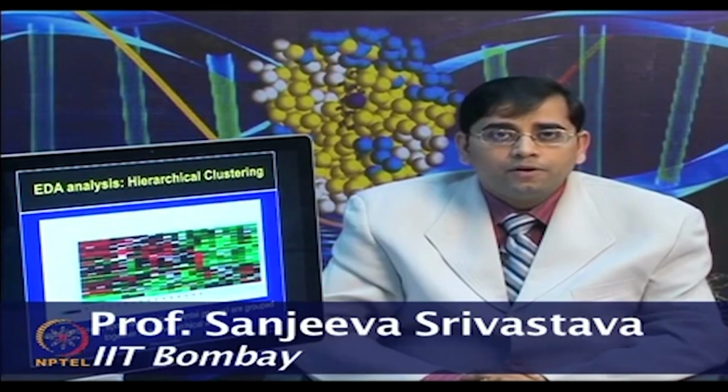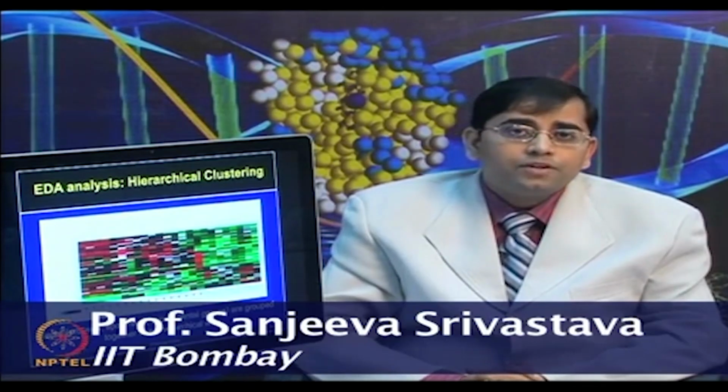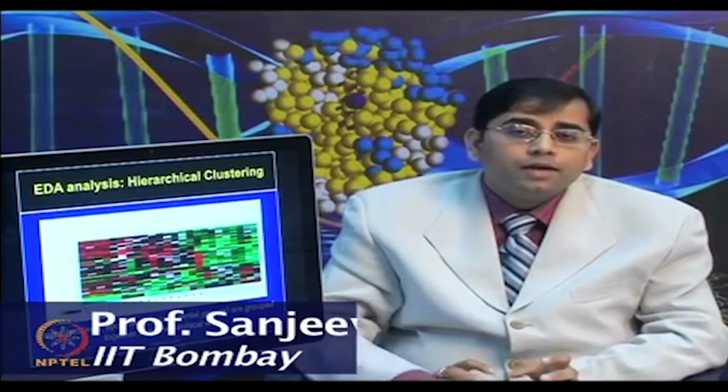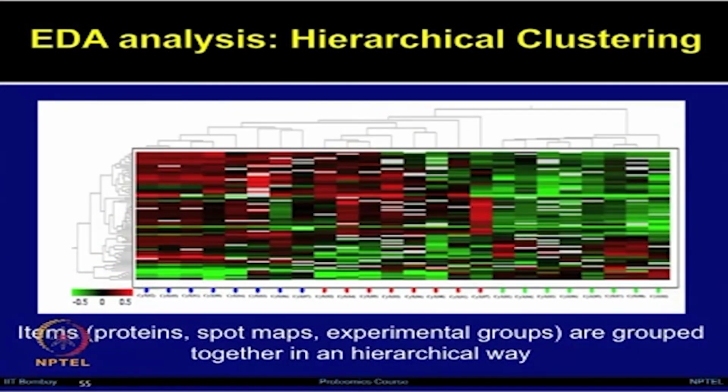giving very useful information. For example, in this data we try to look at one control and two different types of treatment groups together. Now, on the extreme right side, all the green shades are from the healthy controls, and then there are two more populations from the patient groups, which are showing many proteins in the red region. It means it has higher protein abundance.